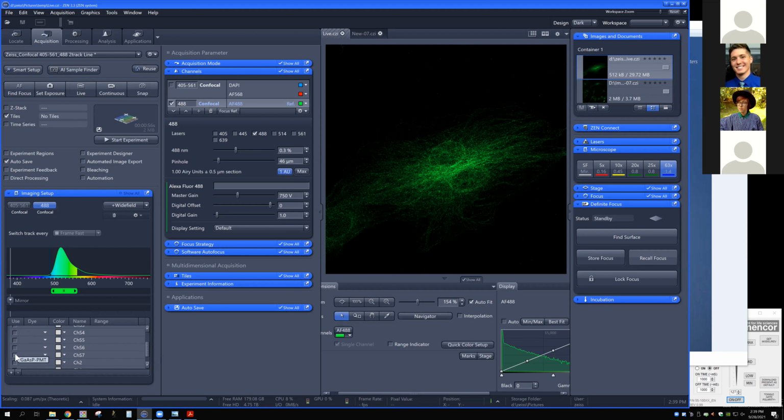Now, you don't really want to do this because most of the time you're going to encounter overlap if you try to use so many at the same time. But we can use this to make the system very flexible when we need to. So let's go back to the kind of setting that I had here before. For these different ranges, if I want to adjust this, I can just grab this bar here and slide this range however I want.